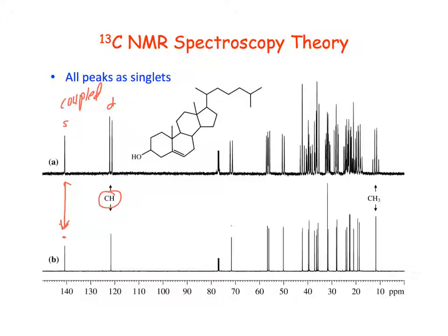Here's another one that shifts to a doublet. A lot of these are. Here's two peaks that are each going to a doublet. But over here, notice that this signal goes to a quartet, so that's a methyl group. Look at this one right here. That looks like a triplet. So it can tell us immediately how many protons are bonded to those carbons.